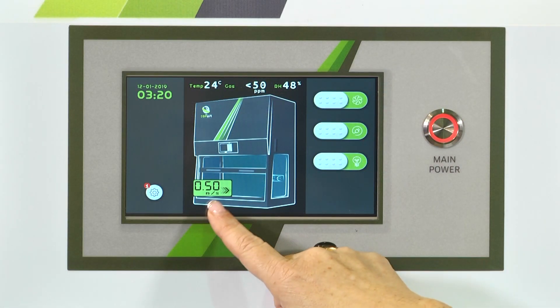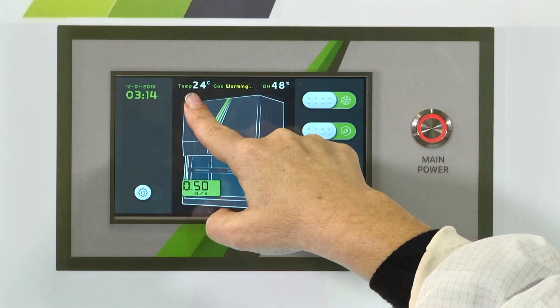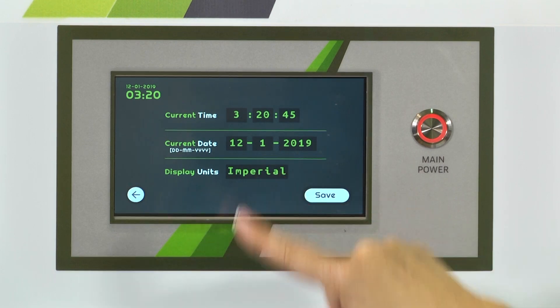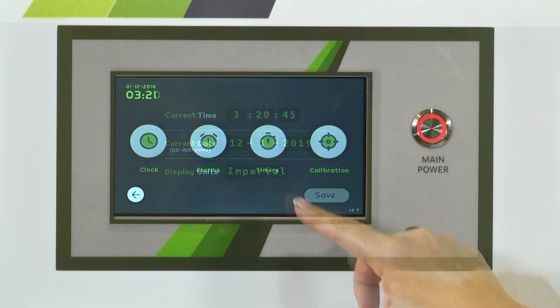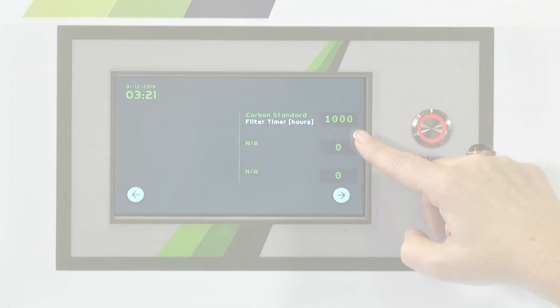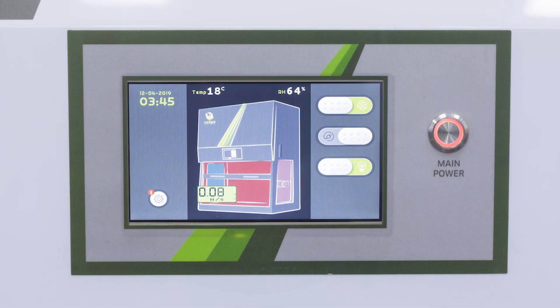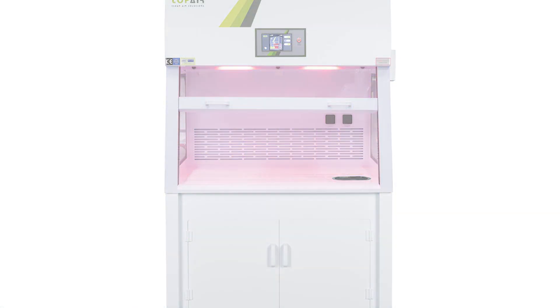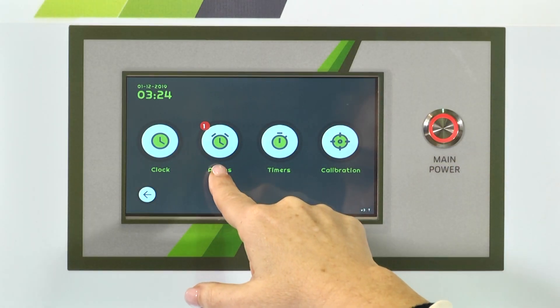The color touch screen offers a friendly graphic display, always showing real-time air velocity, temperature, and humidity level. It offers a display of metric or imperial systems, timers for filter replacement for up to three filters, and timers for the next scheduled maintenance. Upon a failure, a red light colors the screen and the unit's interior, so staff can easily detect the failure even from a distance. There is also an audio alarm which can be muted.